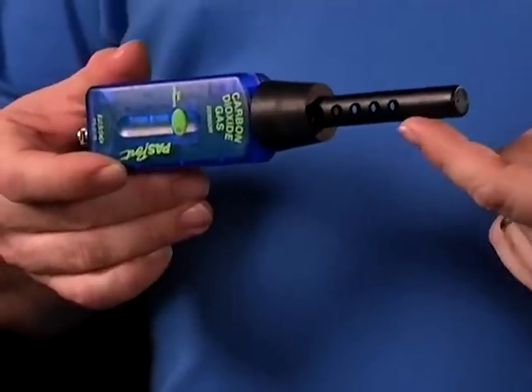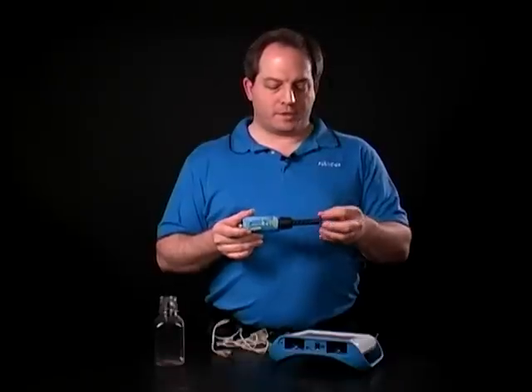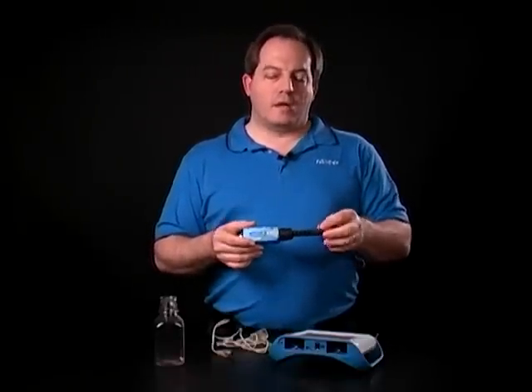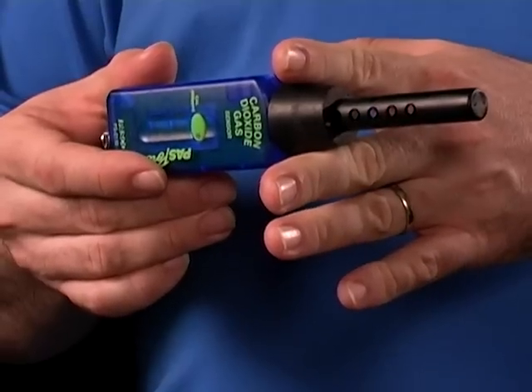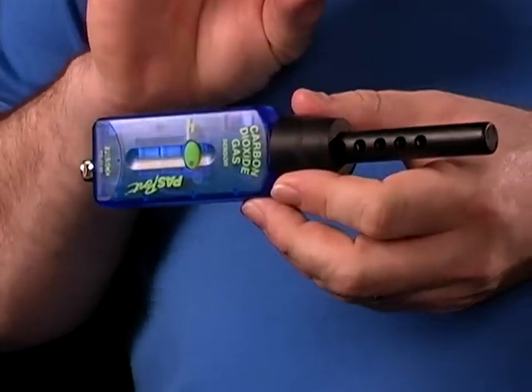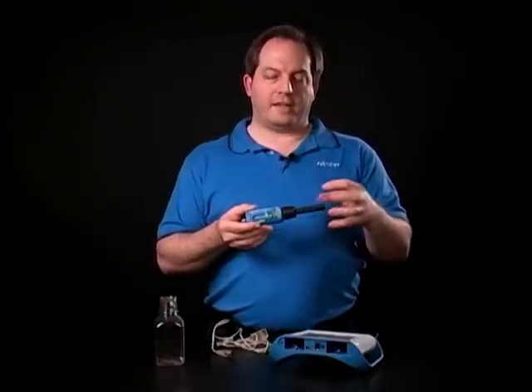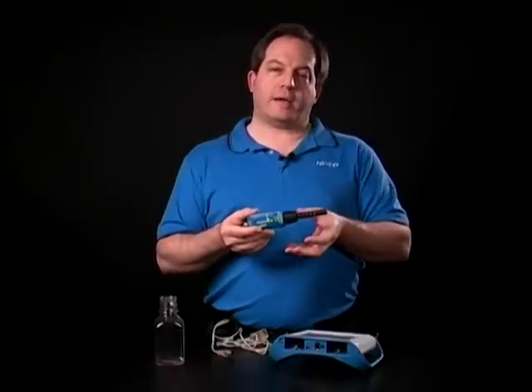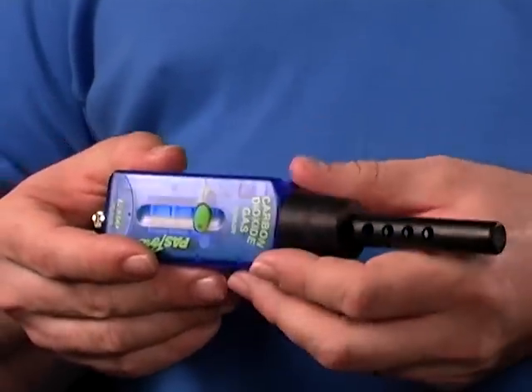You can see the holes here for that. At one end of the snout, we have a light that's going to be shining about once per second, and when it's on, you'll see that it actually flashes about once per second. It's going to be passing through the snout, going to a narrow pass filter at this end, and through that narrow pass filter to a thermopile at the far end. That thermopile will measure the amount of light coming through at that narrow range, and the CO2 that passes through here will absorb some portion of that light, and that's how we get the concentration of CO2 in the air.